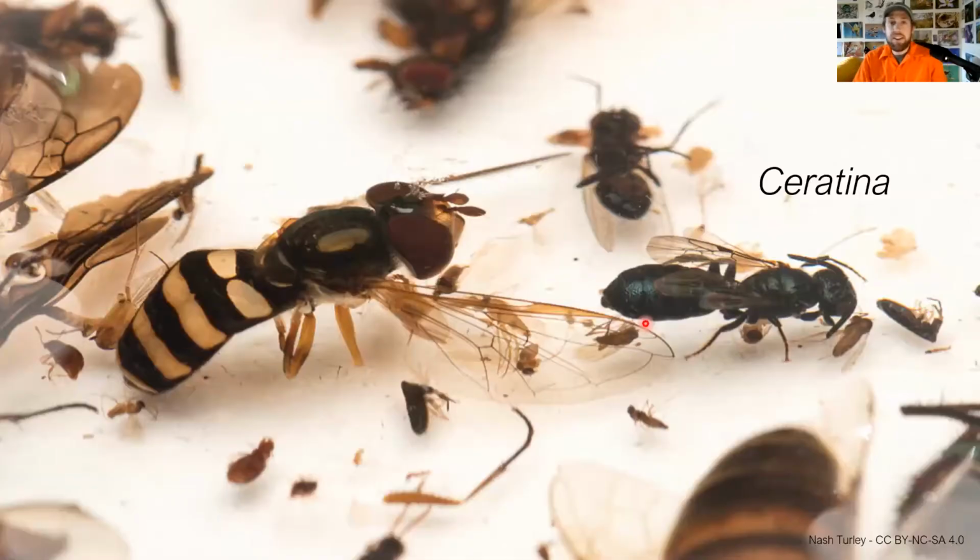All right, so now we have Ceratina. Actually, you can see that little Hershey's Kiss butt in this one, which is good. And then this is a syrphid, or a hoverfly. Most distinctively, they have these tiny little antennae and enormous eyes. Once you know what syrphids look like, they're quite easy to tell from bees when you look close.